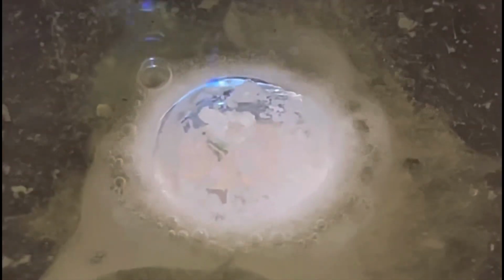It removes that layer of gallium sulfate and causes the gallium drop to expand. And then as it combines with the sulfuric acid, it makes gallium sulfate, and that causes it to constrict. And then the potassium dichromate removes that layer and it expands again in oscillations that look like a beating heart.